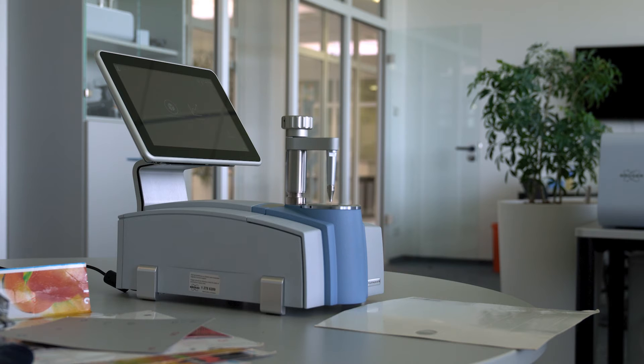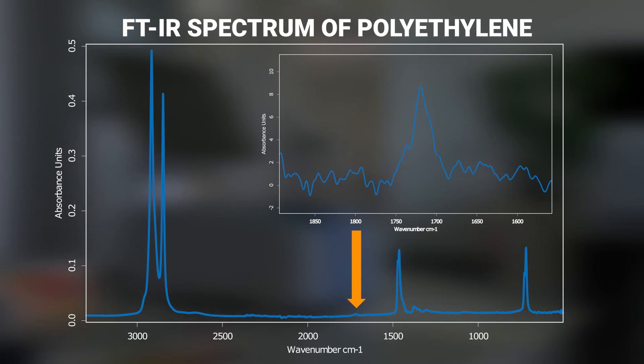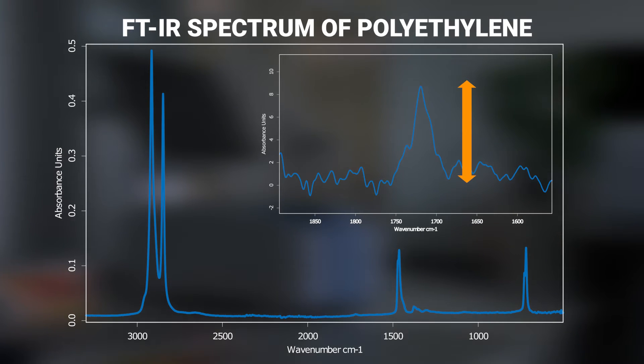We will determine this based on the intensity of the carboxyl band in the IR spectrum of polyethylene at 1715 wavenumbers. The more intense the IR signal, the higher the degree of oxidation.